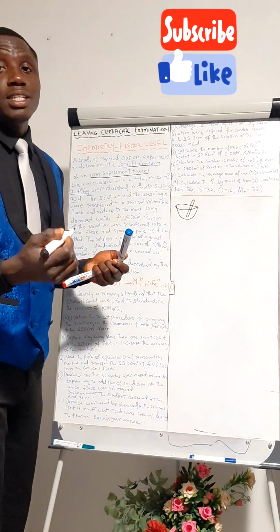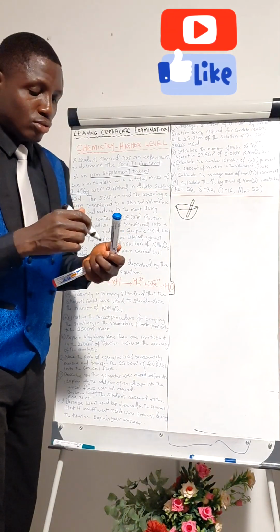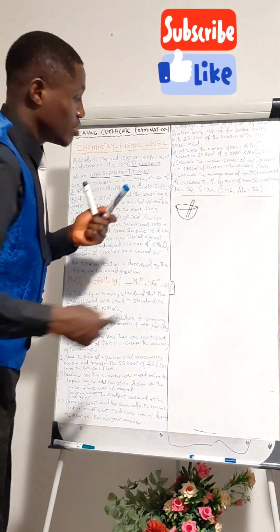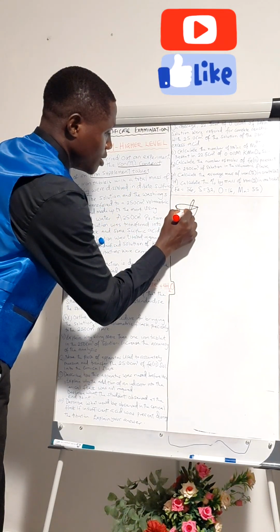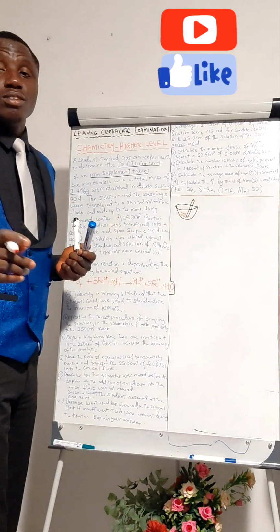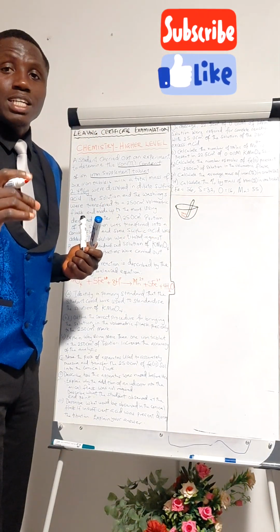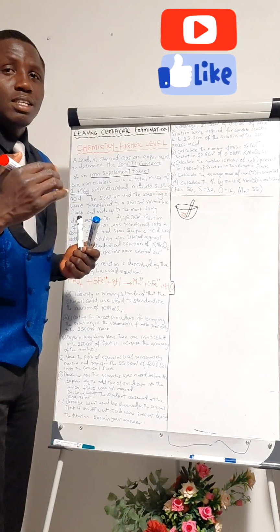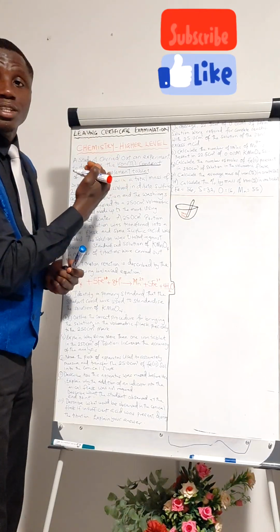Sometimes you can add acid directly to the tablet, but it is advisable to grind the 6 tablets in order to have an increase in surface area, because the particles will then be able to interact with the solvent, the sulfuric acid and water, so that you can have a good dissolution of the iron content.